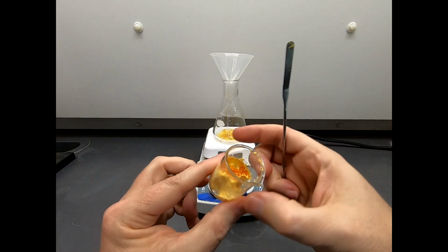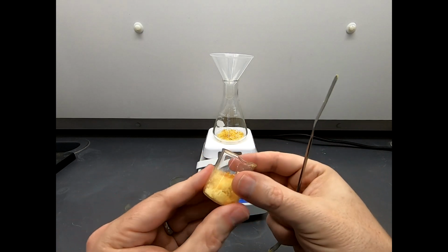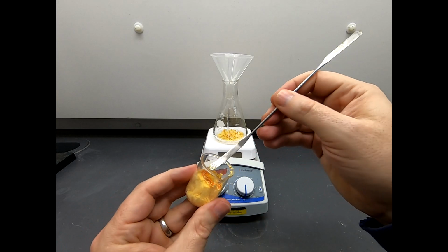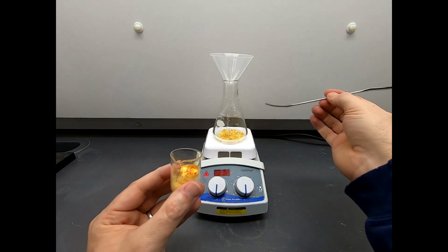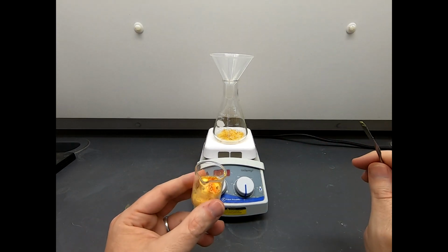And now you can see I've sort of worked my way around here a little bit. I'm going to keep on breaking up this solid with this spatula. And once I'm done with this and I've transferred all the contents of this beaker that I can into here, then we'll go ahead and move on to the next step.